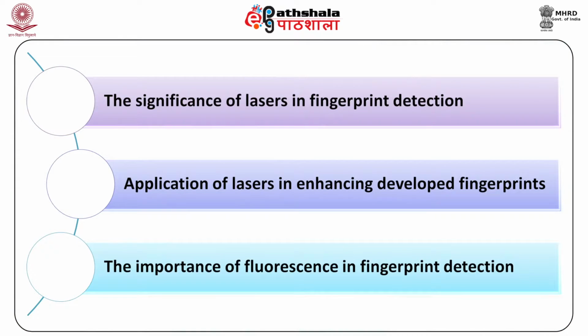After studying this module, you shall be able to know the significance of lasers in fingerprint detection. You'll learn application of lasers in enhancing developed fingerprints, and you'll also learn the importance of fluorescence in fingerprint detection.